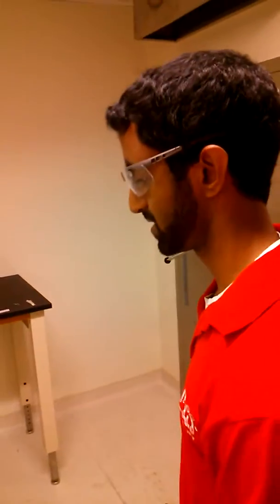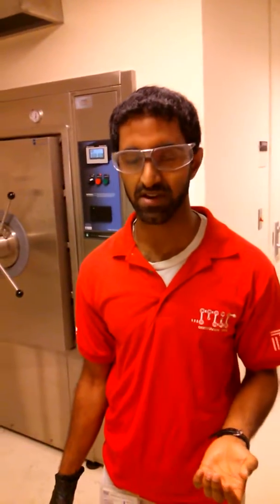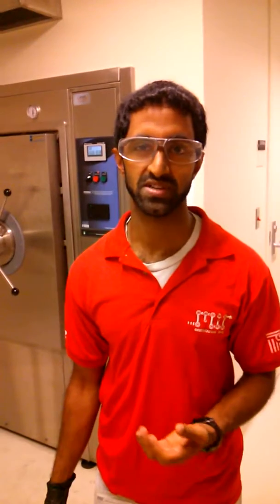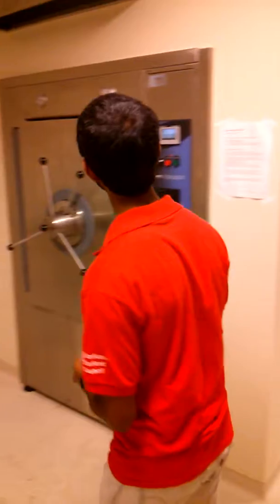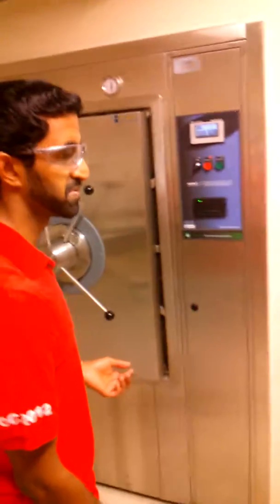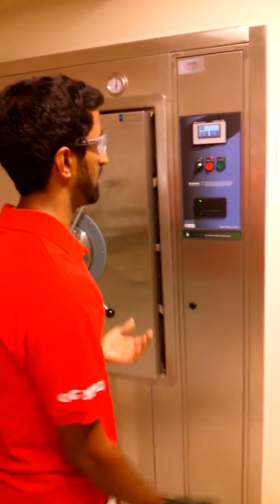This next room is the autoclave room. So, in the Prather Lab, we work with a lot of sterile glassware and sterile media. And the primary way in which we make these things sterile is by autoclaving, which just means heating up in an oven to high temperature and pressure. So this is our autoclave. There will probably be a separate video associated with exactly how to use the autoclave, although in general these instructions here are a very self-explanatory and useful guide.